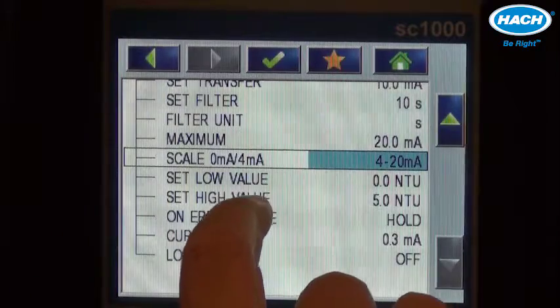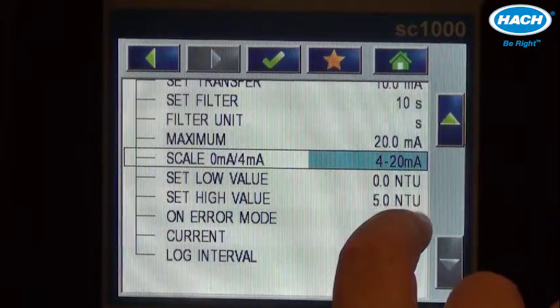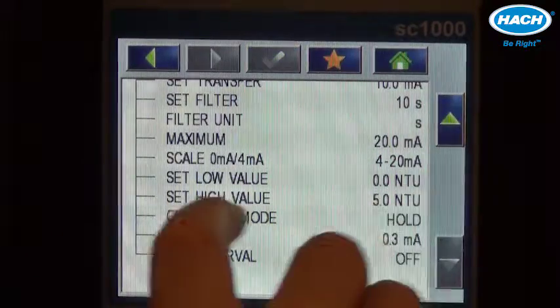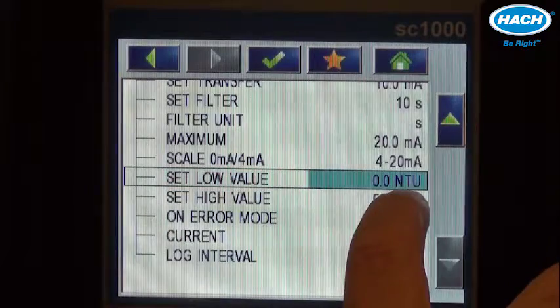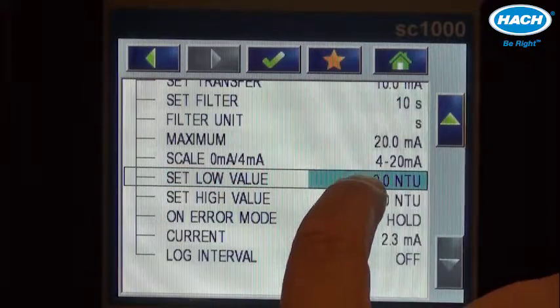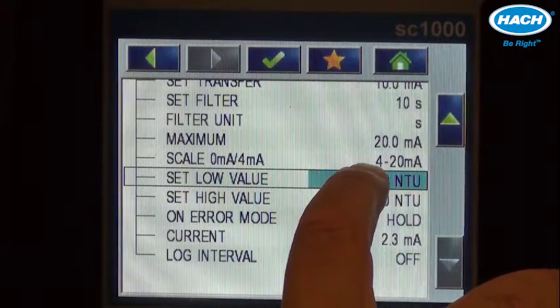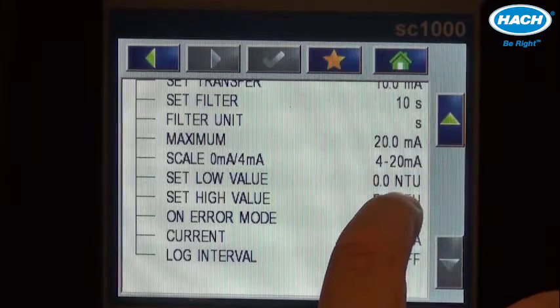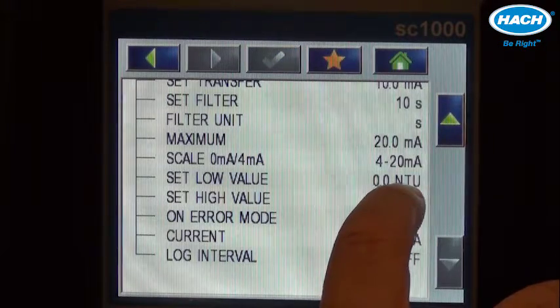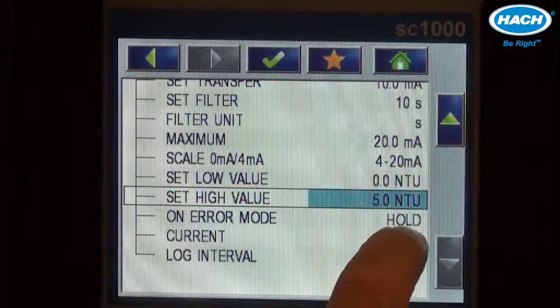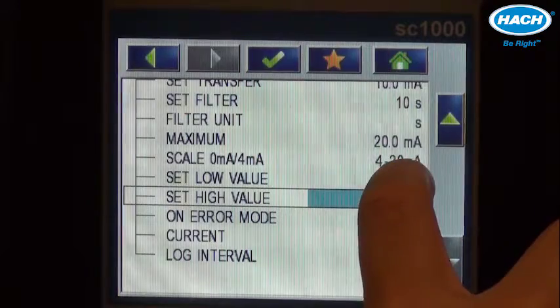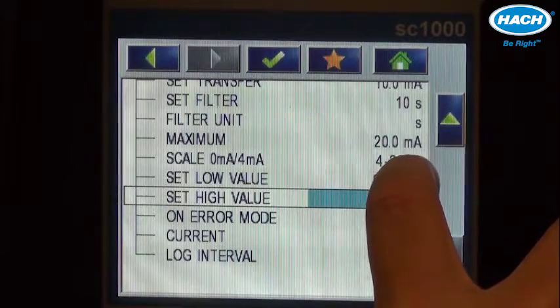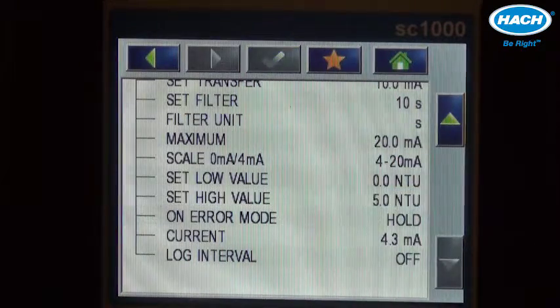And then our last setting is the low and the high value. The low value is the concentration in NTU that will be equivalent to 4 milliamps. 0 NTU is appropriate in this case.